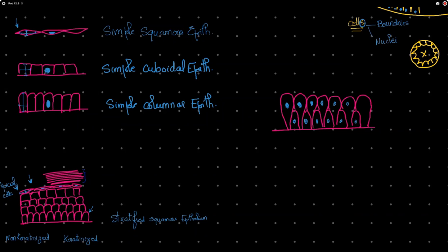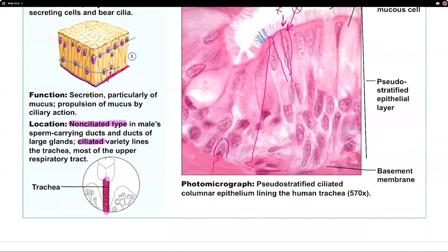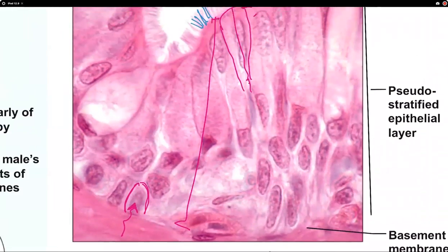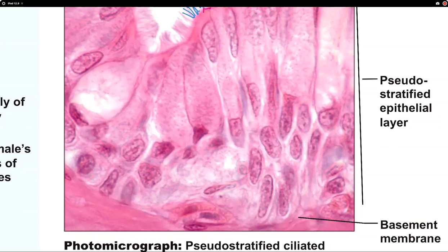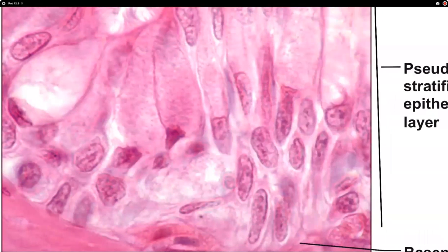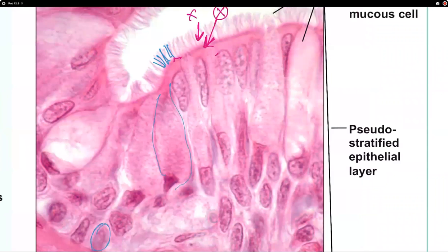And when I look at the basal cell layers, I see they are much smaller in size. So I look here, I'm about to say it's stratified, many cell layers on top of one another. But when I looked here, I found that the cells at the base are smaller in size compared to the cells at the top. Much smaller in size. So this doesn't make sense.